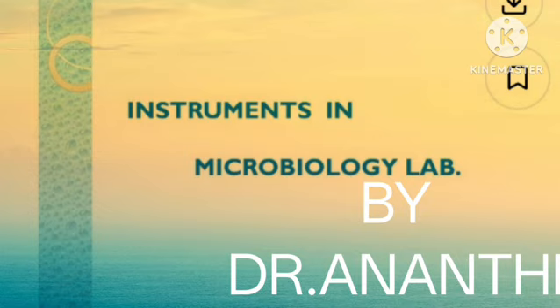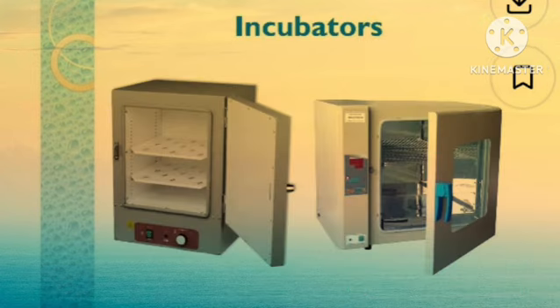The most critical instruments in a microbiology laboratory are the microscope for visualization, the autoclave for sterilization, and the incubator for growing microbial cultures, because microbiology requires a sterile environment to isolate and analyze microscopic life.